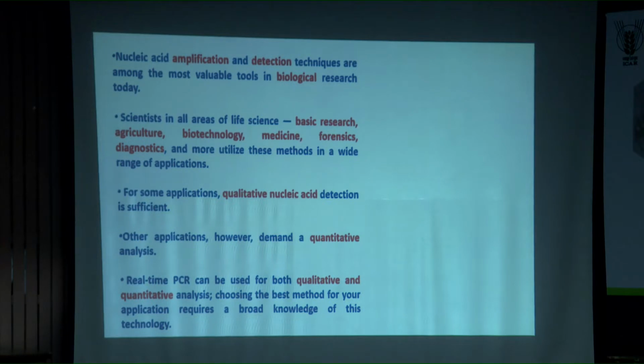And choosing the best method for your application requires a broad knowledge of this particular technique. This is also very, very important. So you need to know how this qPCR technique works before you lay your hand on this particular tool.